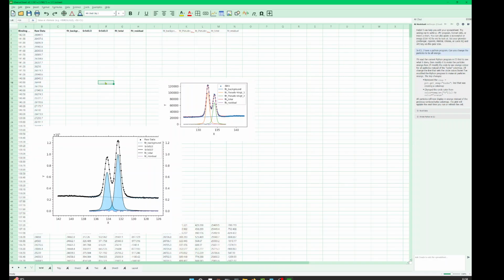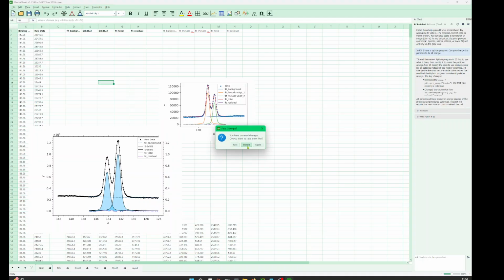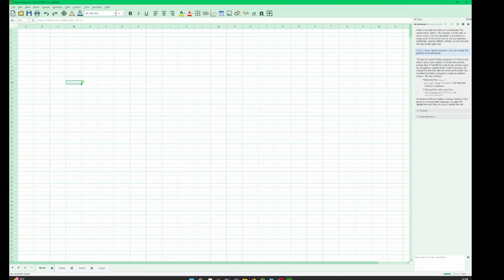And I think now if I just show you the basic of Excel, so of course, if it's Excel, it needs to be able to do what Excel does. So for example, I get 1, 2, 3. I can then use those cells, propagate. I get that.